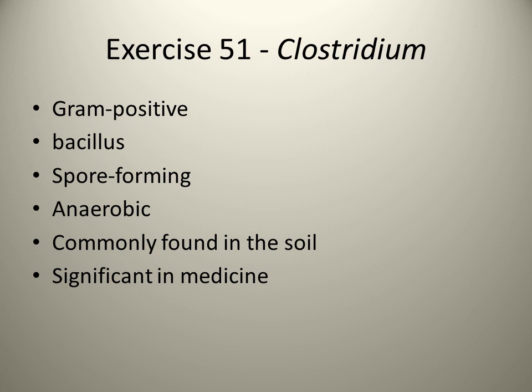One of the other common soil microorganisms which is looked at is in exercise 51, and that is Clostridium. Clostridium is also gram-positive. It is also bacillus-shaped. It also forms spores. So you might have to do some additional testing to determine, do I have the Bacillus genus or do I have the Clostridium genus?